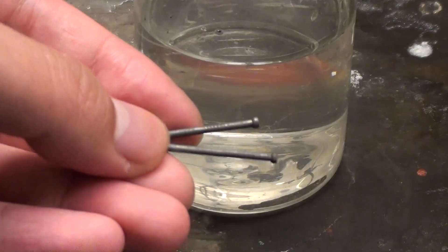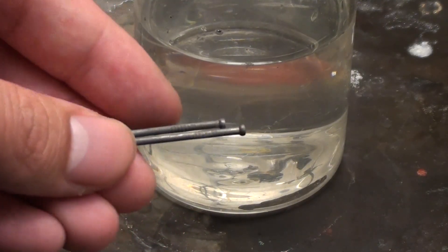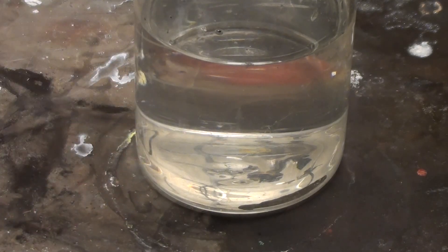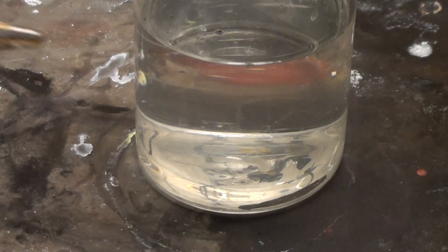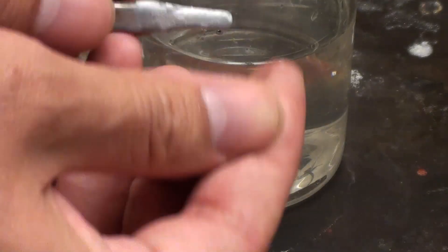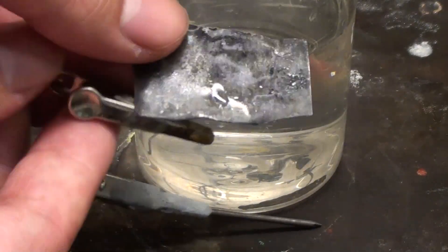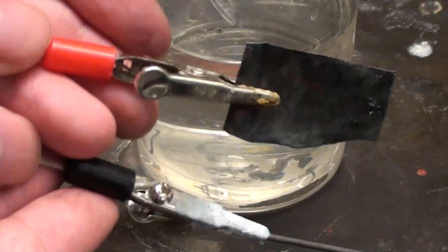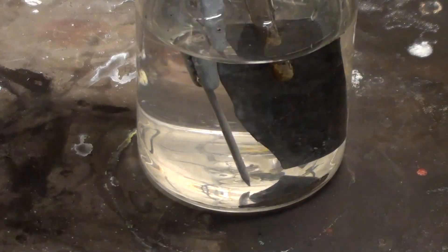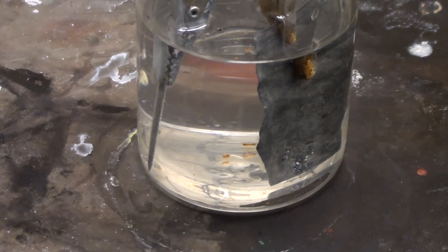Here are the two clean iron nails we're going to perform this experiment on. I will plate one of them and leave the other as a control experiment. These clips lead to a 5 volt power supply off camera. Take the nail and clip the negative terminal of the power supply to it. Now with the positive terminal, clip it to a strip of zinc metal. Place the two electrodes into the zinc sulfate solution and make sure they don't touch. Now turn on the power and run the current for about a minute or two.